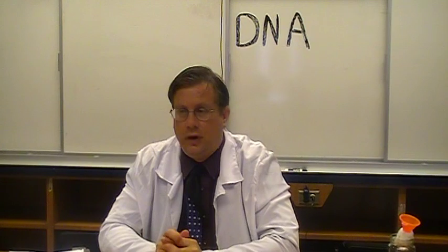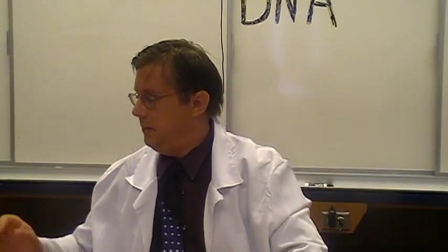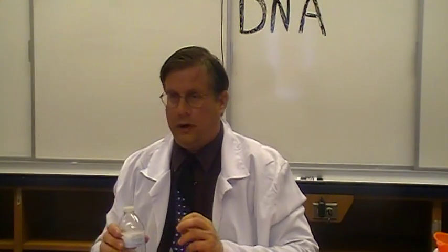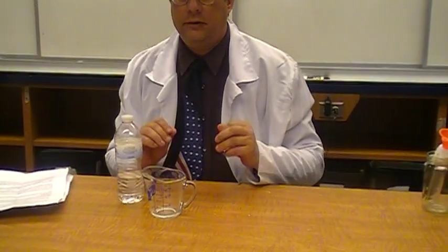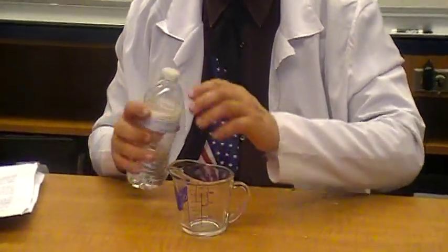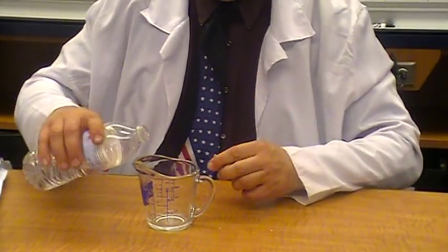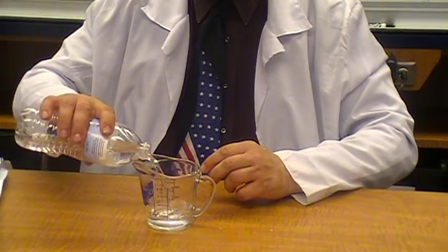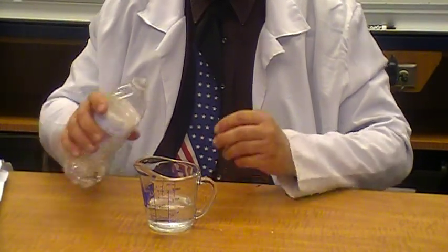While Alex is continuing smushing up the strawberries, I'm going to mix what I call a lysis solution. And lysis simply means to break open. So, I'm going to take my measuring cup, and what I'm going to do is create a solution that's going to help break open the membranes that protect the DNA so we can get to it. So, I'm going to put in about a half a cup of water.